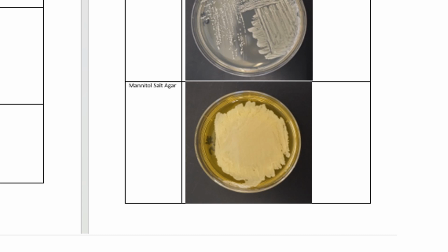Then in your discussion, you're going to go back and tell me essentially what you did with number 5 and the result. You got this and this and this result, and that leads you to identify unknown number 5 as Mycobacterium tuberculosis or Escherichia coli or whatever.